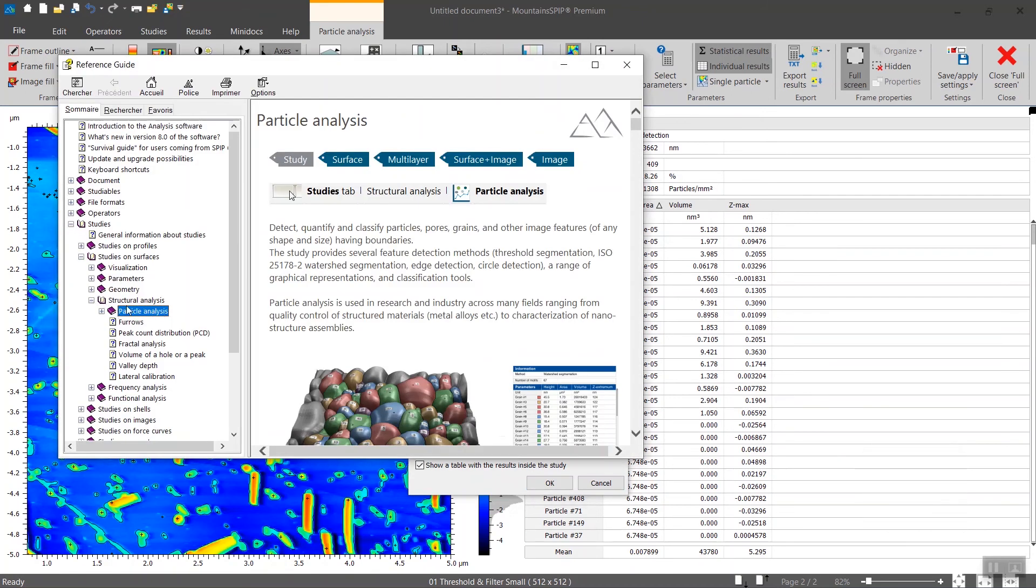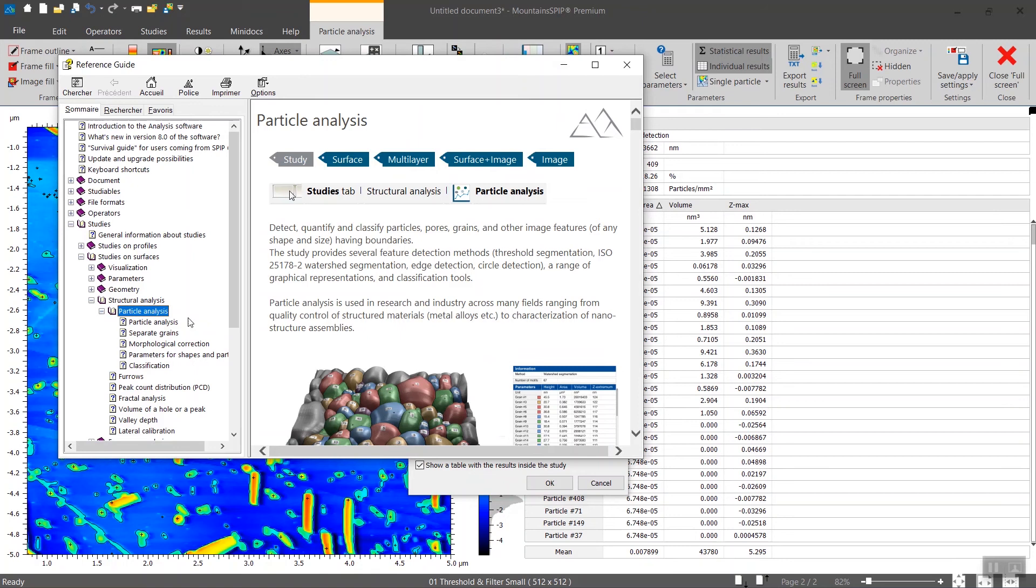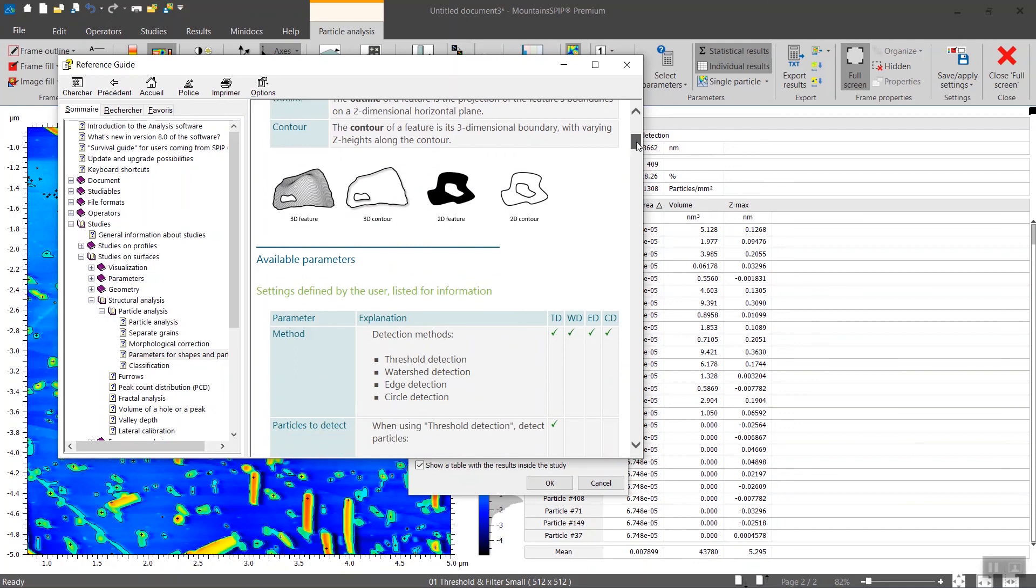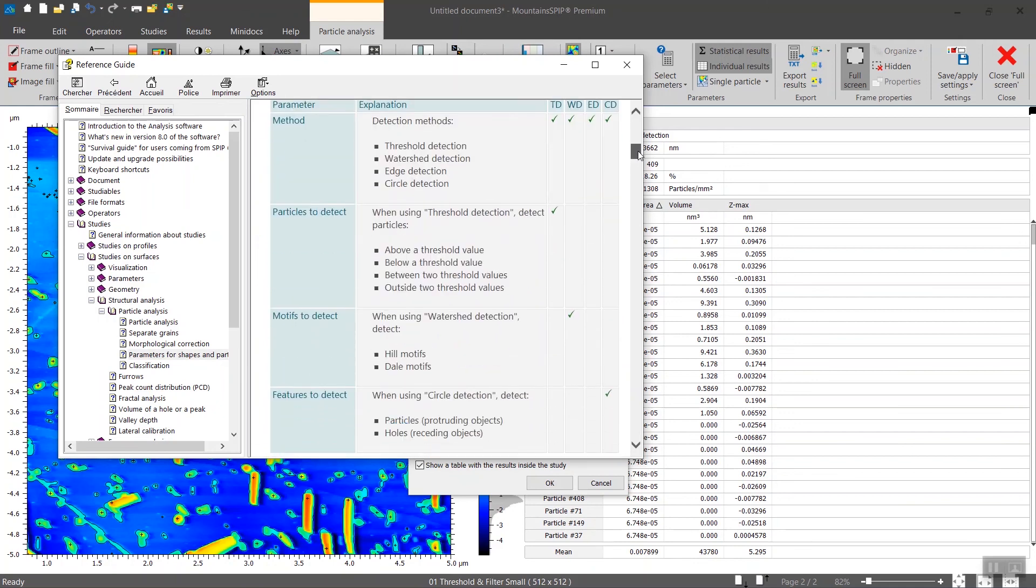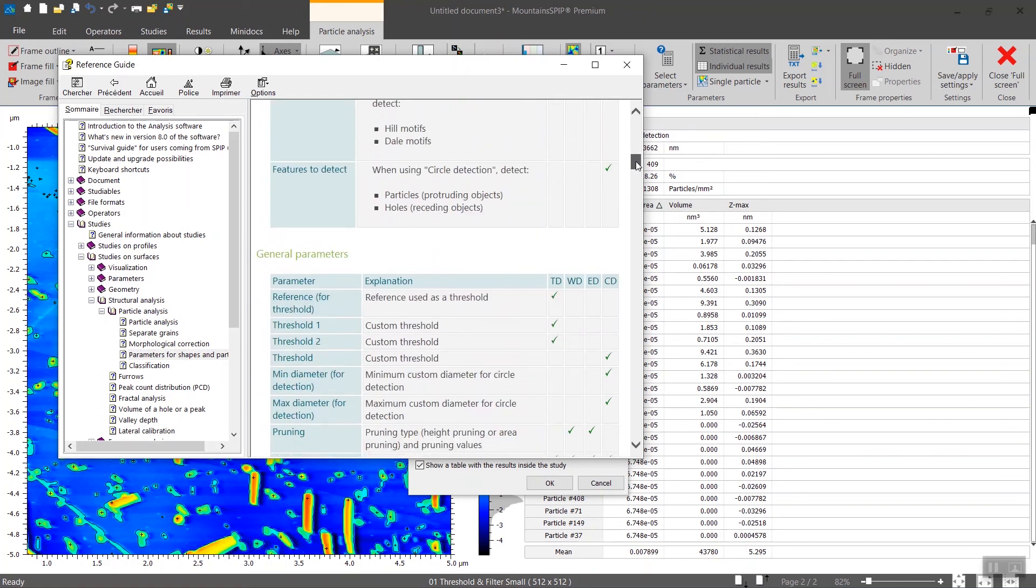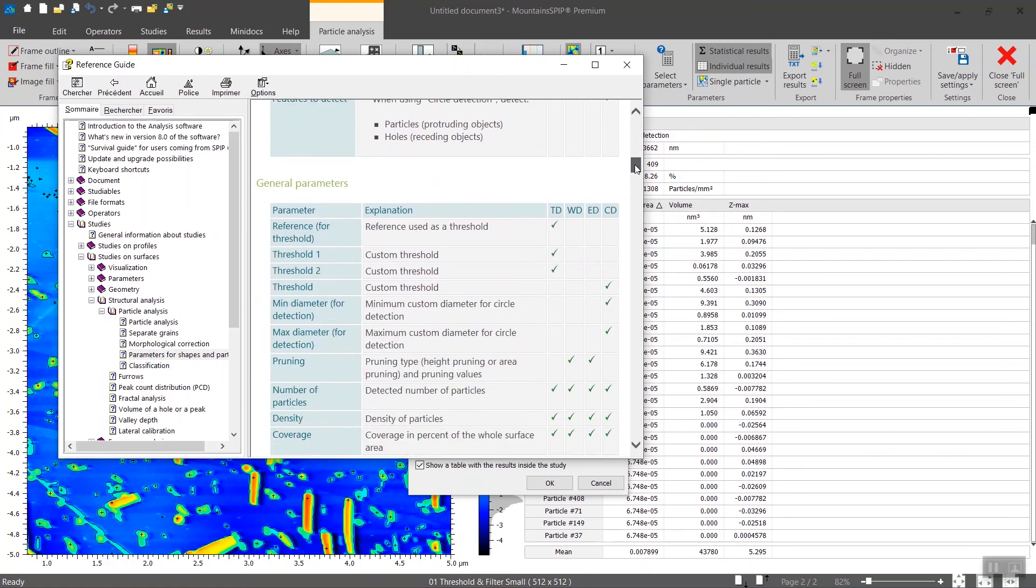Then in the particle analysis section of the help, you have a section here called parameters and all of the parameters that we provide are fully described. And the help section tells you in which method they are available.